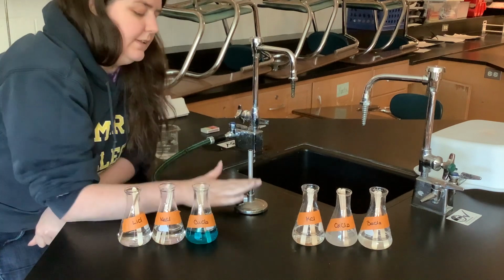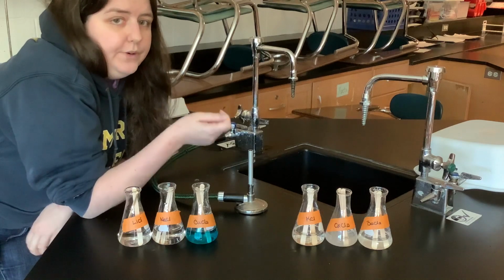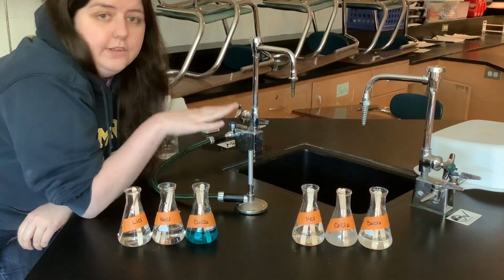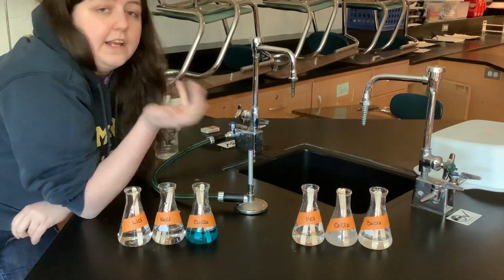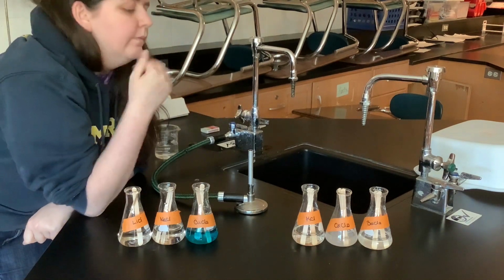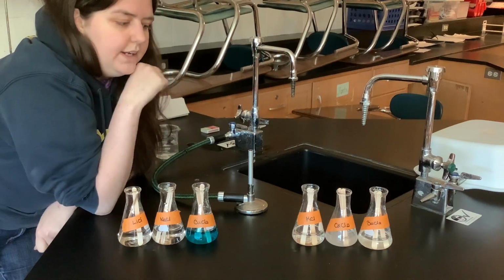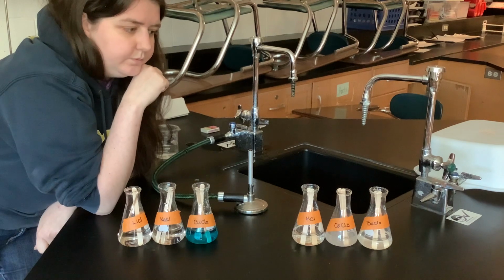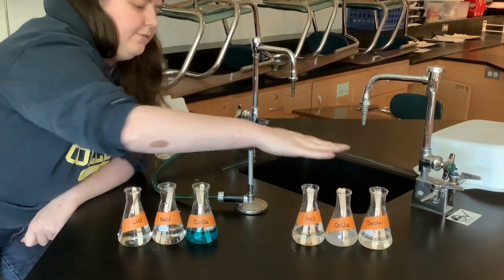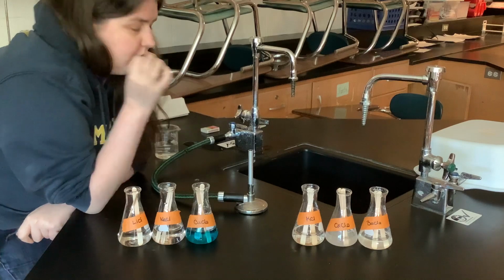What's gonna happen is I'm going to light this Bunsen burner, so there's gonna be fire, and I'm going to carefully burn the end of each stick to try and burn the solution off. And when that happens, the fire is going to change colors. This is actually the principle behind how fireworks are made and how they get all those different colors. So that's basically what you need to know. We're gonna talk a little bit more in class about the chemistry behind this, but you at least needed to know these are different metal salt solutions and that's what's gonna be causing the color to change, okay?